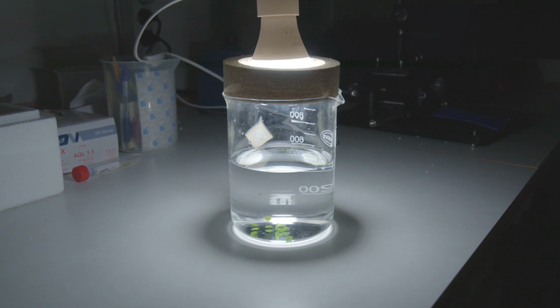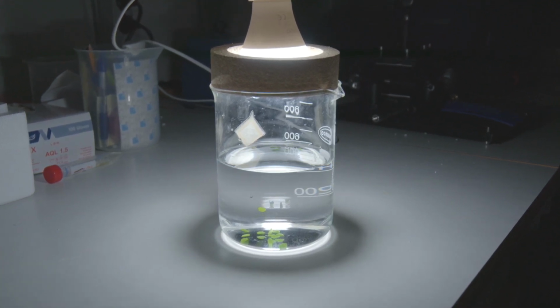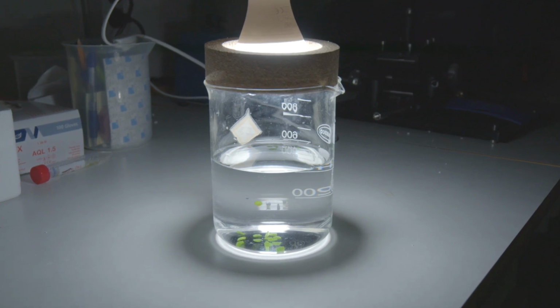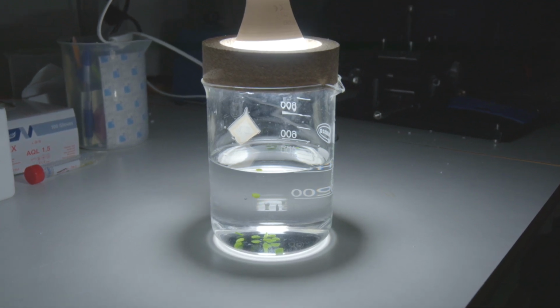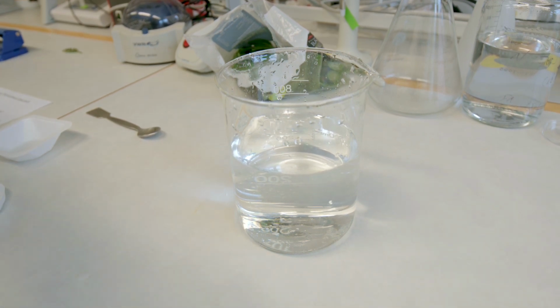Today, we are starting from the first step of artificial photosynthesis research, studying natural photosynthesis as it happens in plant leaves. Because it is hard to study something that you can't see, we are going to find a simple way to observe it in action and measure how fast it goes.